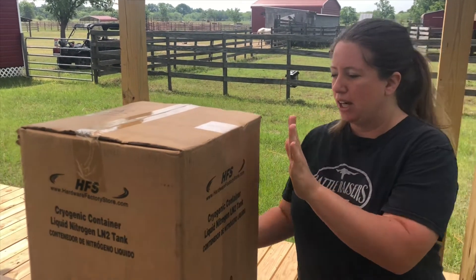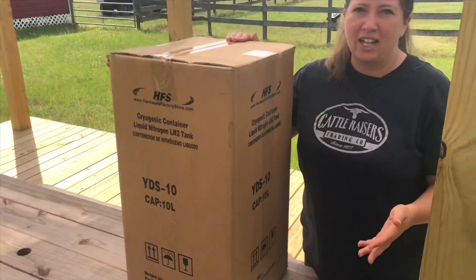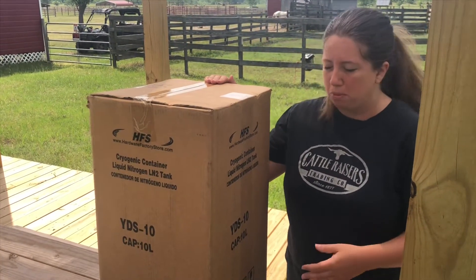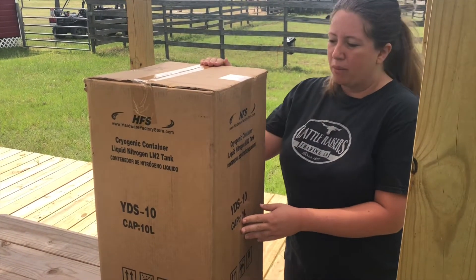This morning I'm going to be unpackaging our brand new cryogenic container, also known as a semen tank to most cow people and horse people. We got a 10 liter capacity nitrogen tank so that we can do more of our own branding and things like that.